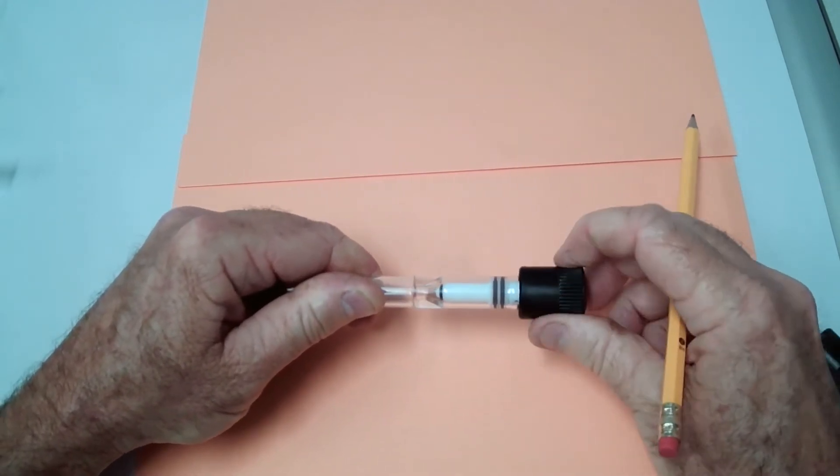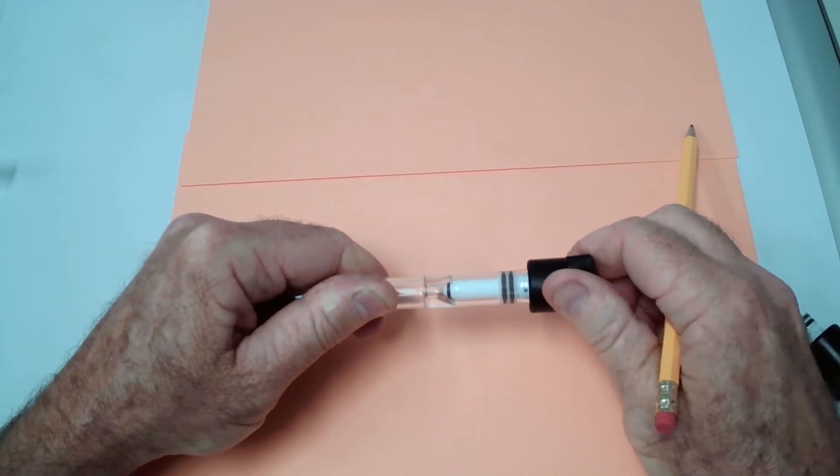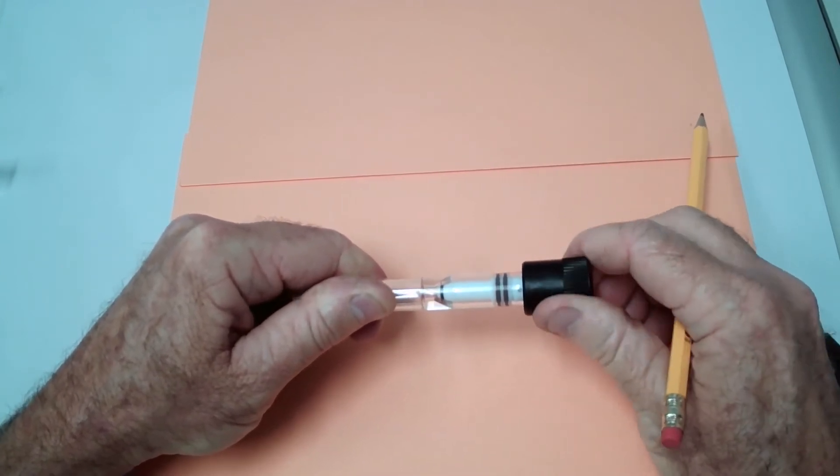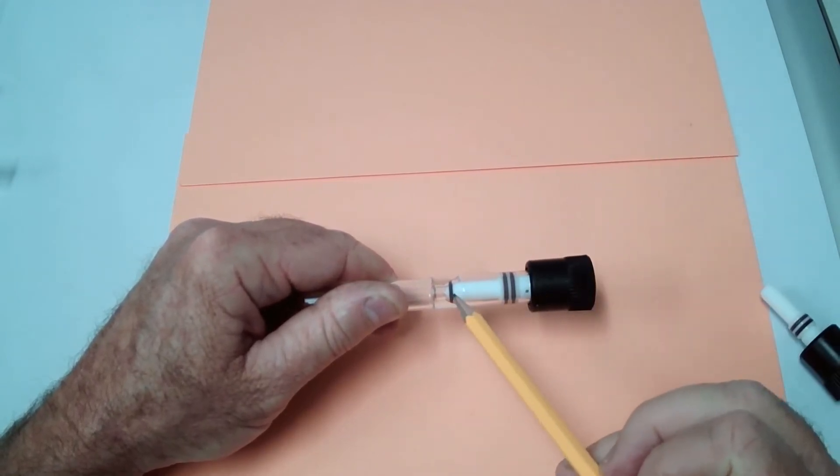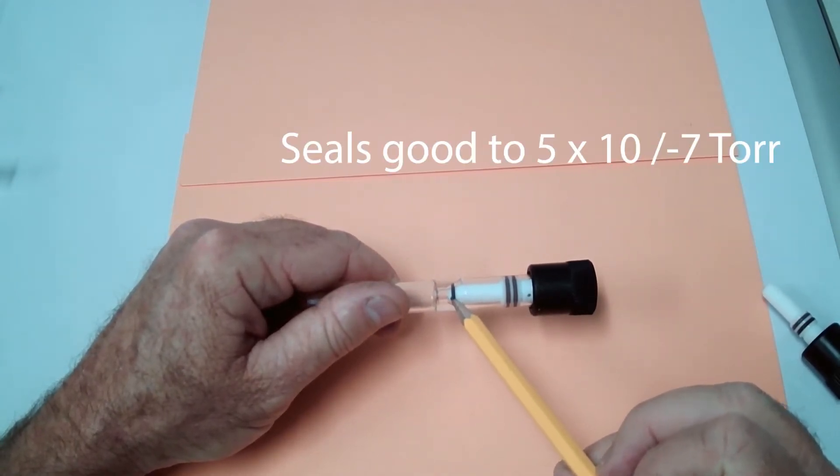And then as you turn this down, you will see the tip of the plug coming in contact with the valve seat right there. It squishes that a little bit and closes it up right there.